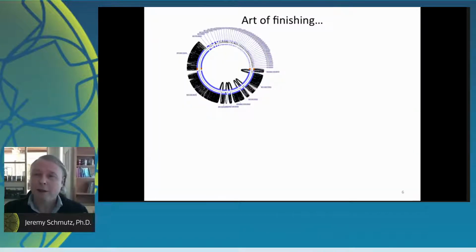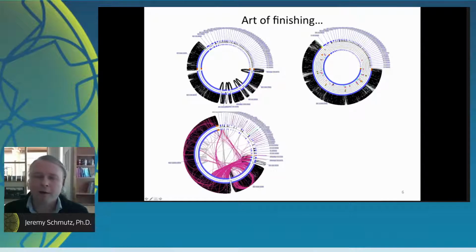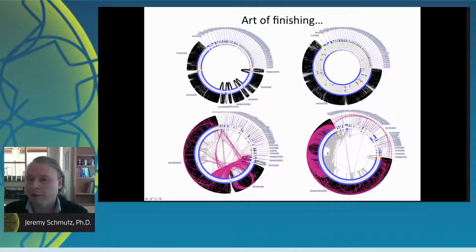And finishing was really like an art. You would go from a clone that looked like this. This is showing paired ends across the circular clone and all these gaps in there. And we do lots of sequencing reactions and lots of manual labor and clean it all up and make it look really nice and get it high quality. Same thing for repeats. We'd go in and sort these things, sometimes for hours or even days, spending time sorting a repetitive region of a clone like this. It looks really nice here. There's a 20 kb repeat in a clone and we sort it all out.